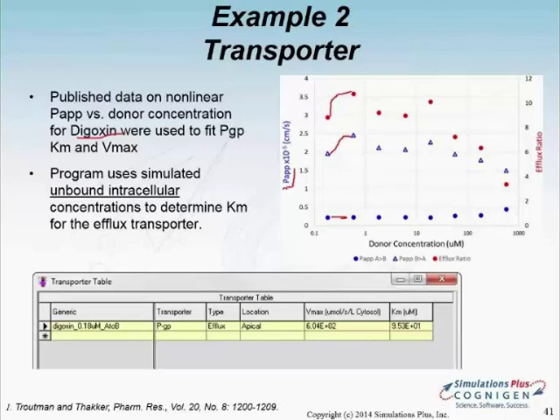Thank you, Viera. A question: how well can this program be used to predict the permeability with DDI or co-administration of two drugs, which might compete for uptake transporters, or one being an inhibitor for efflux transporters? That's something I mentioned in one of the early slides. Right now it's not fitted for DDI type simulations. That would probably be one of the first expansions for the model, accounting for the interactions and being able to fit the Ki values or competition. But right now it is a single molecule type simulation.